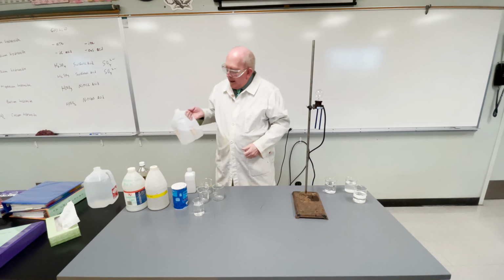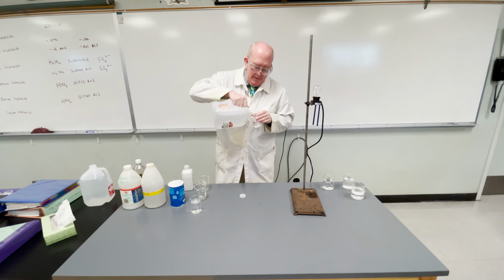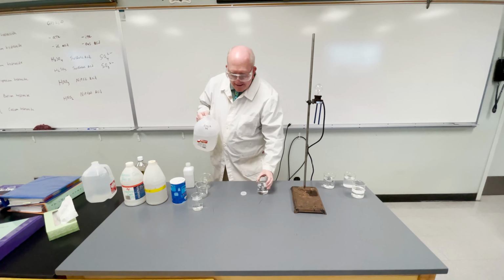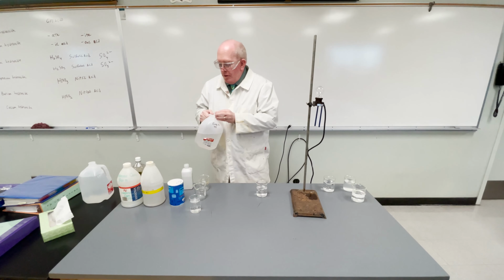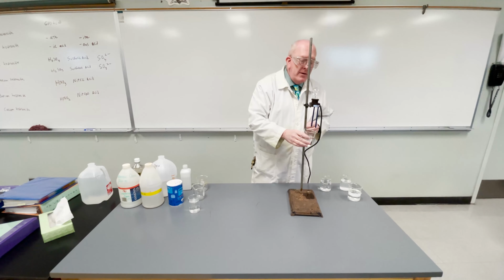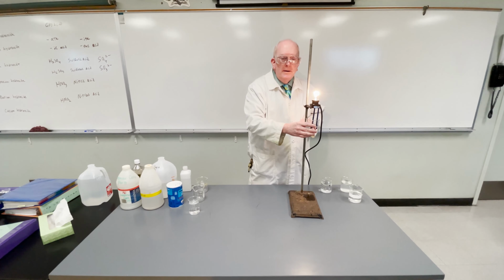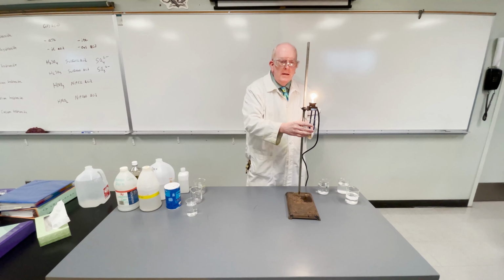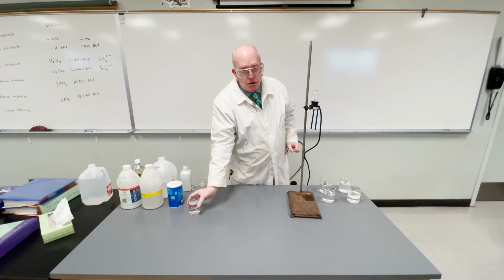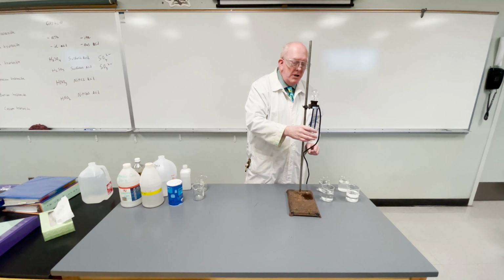Now this bottle, I mixed up some 1 molar sodium hydroxide. Get that in there. Sodium hydroxide has an ionic bond. It should be a strong base. It should fully dissociate the same way the strong acid did. Ooh, that's bright. That's so bright I need to wear shades. Okay, look at that go. So both of those are strong electrolytes, a strong acid and a strong base. Wash that off real good.